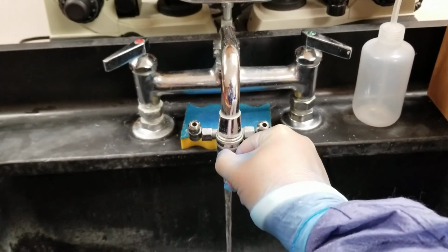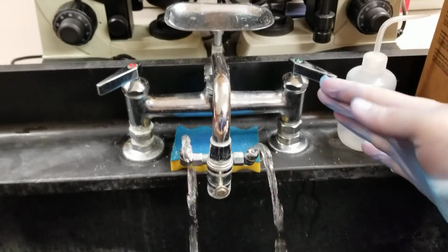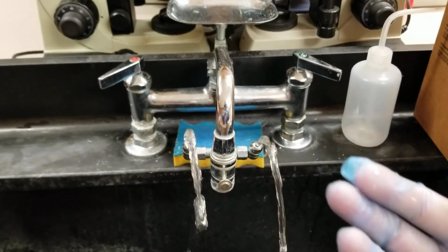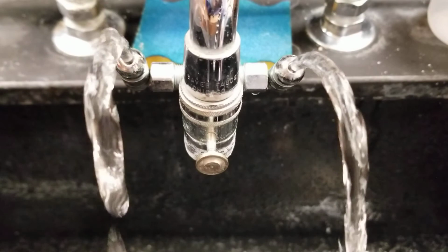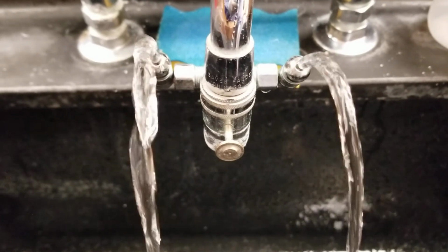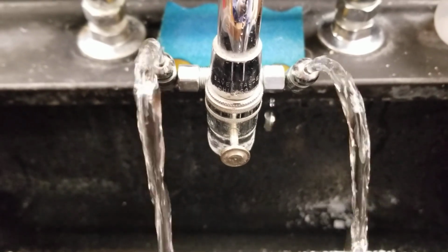But you pull out this little button in the middle. And of course, if you turn this all the way on, yes, the jets will come up closer and you will shove the person's eyes in there so that they are completely submerged. Again, glasses need to be off, contact lenses need to be out of eyes, and the person's eyes need to be open when put into the water flow.